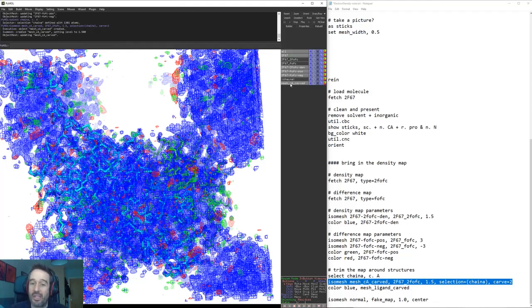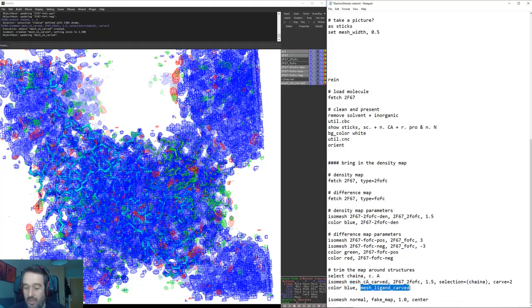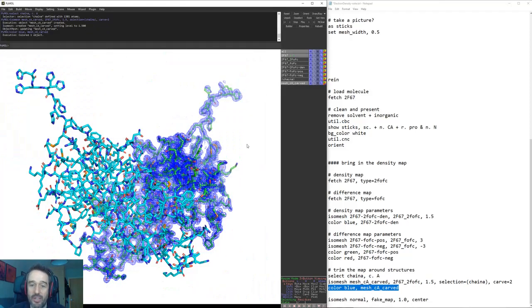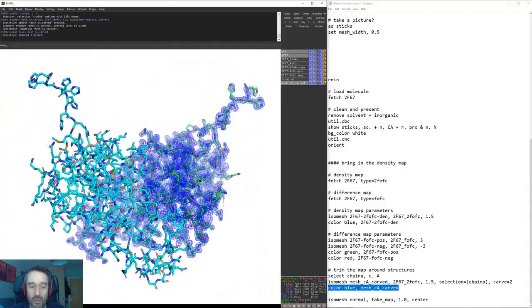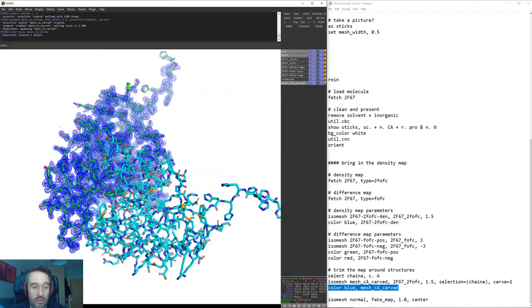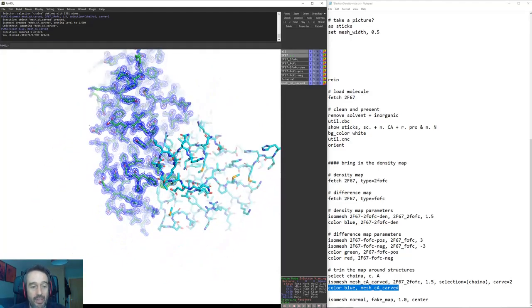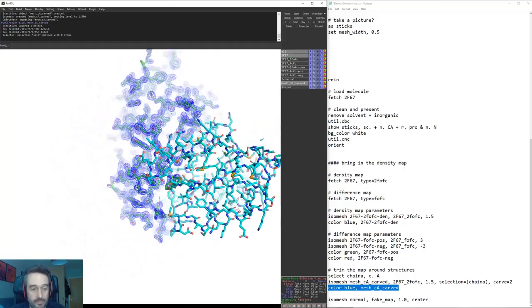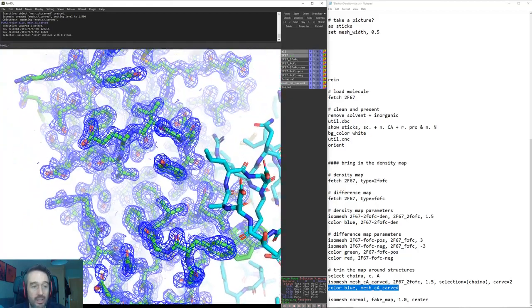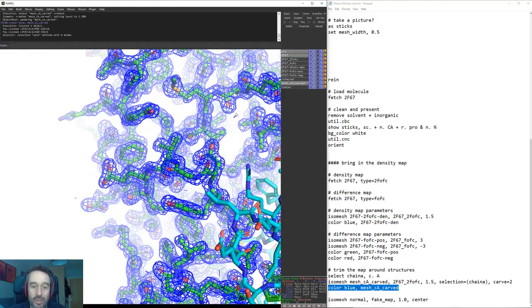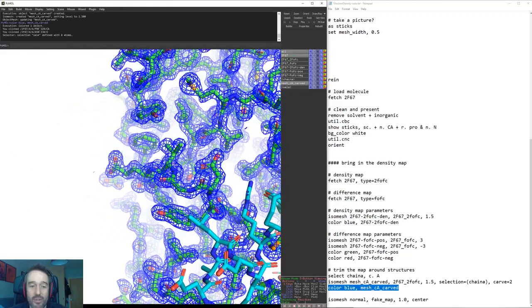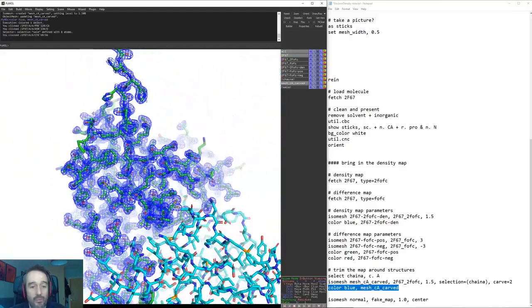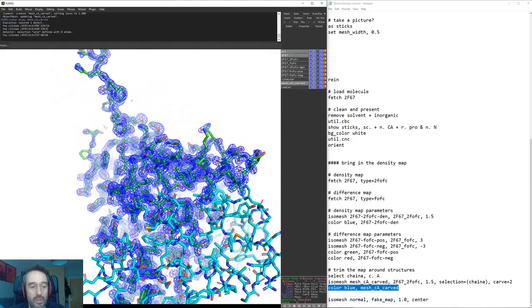You can see that's now made us a new object here called mesh CA carved and what we'll do is we will color that into blue. Now what we'll do is we'll just remove our old meshes that we had here and just display this single carved mesh. Now you can see that we are only displaying the contour map that is within two angstroms of chain A, and that cutoff is enough really to visualize most of the electron density. You can see there's a few little fragments here and there where maybe we could make that cutoff 1.8 or something so that we're not including some of those small fragments, but largely there's not a lot of noise using that cutoff there.